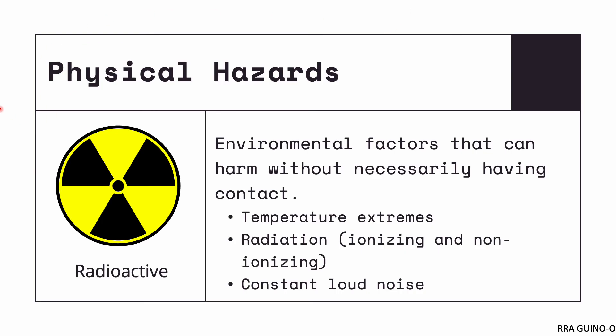Next, let's talk about physical hazards. In contrast to chemical or biological hazards, physical hazards are environmental factors that can cause harm without necessarily having contact with an individual. Some examples are temperature extremes — either extremely hot or extremely low temperatures — radiation, including ionizing radiation such as x-rays and non-ionizing radiation such as microwaves, and constant loud noise, which can lead to detrimental effects on your hearing.